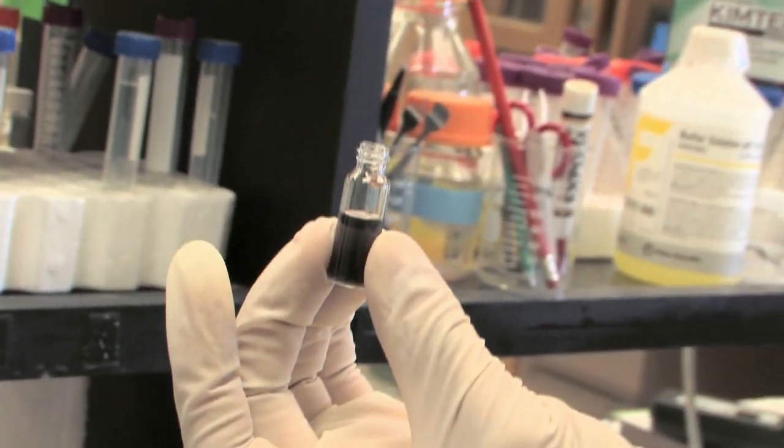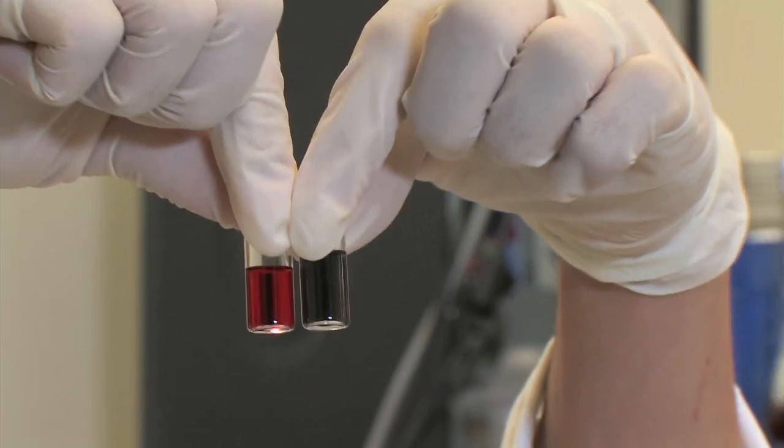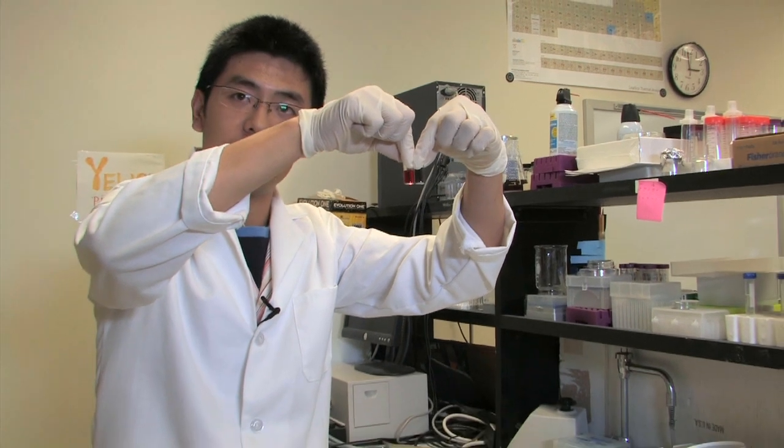Here is the comparison. Before and after addition of the targets, we will see this huge color transition. Biosensor detection by seeing color changes.